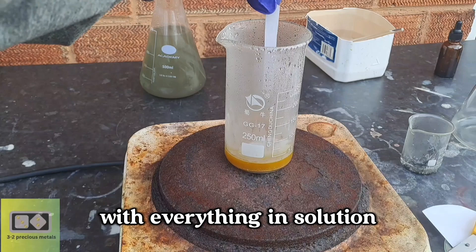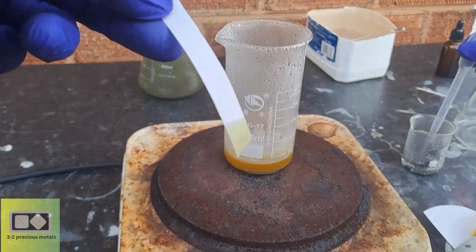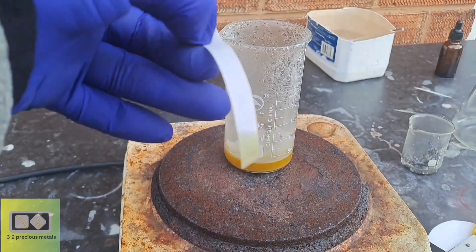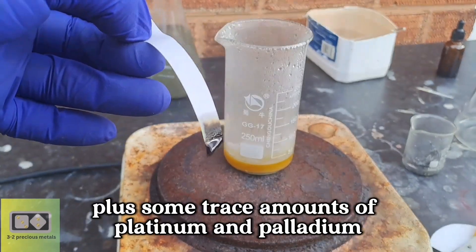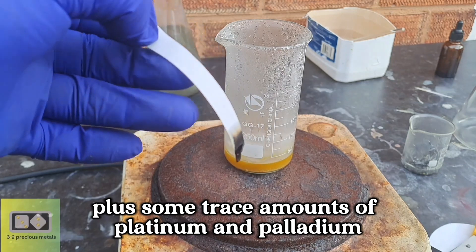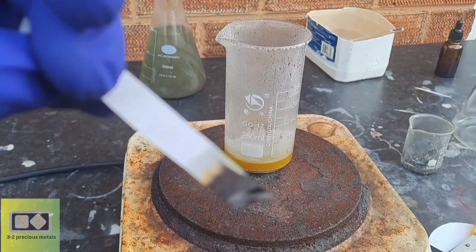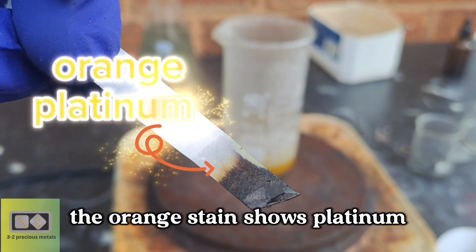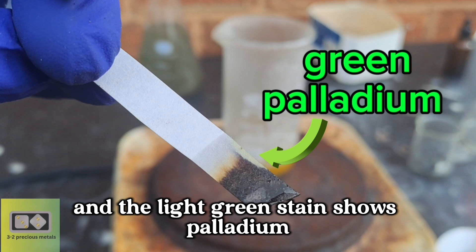With everything in solution, it's time for a quick stannous chloride test. And it looks as if there is gold, plus some trace amounts of platinum and palladium. The orange stain shows platinum, and the light green stain shows palladium.